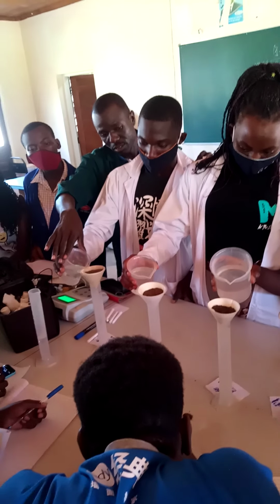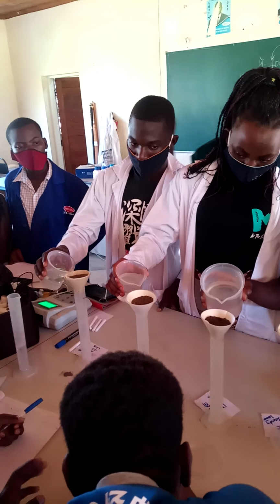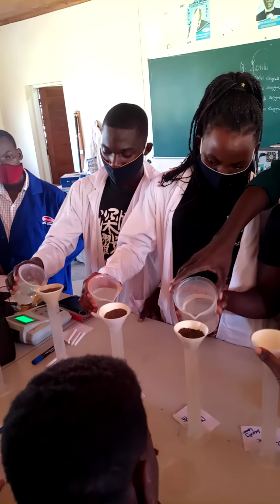For you to continue pouring, but the person who is holding the stop clock, you immediately see the first drop, you stop. You don't want to see how much time they take, okay? Just put that thing, madam, put it like this, because even that time is not calculated. Right? Like this. Okay, referee. 3, 2, 1, 0.